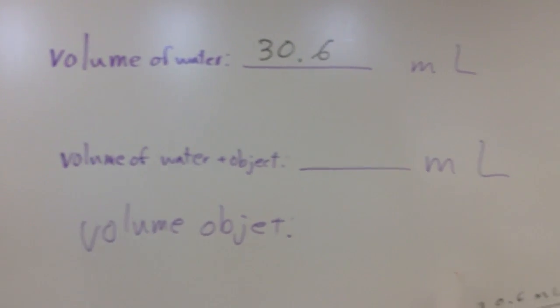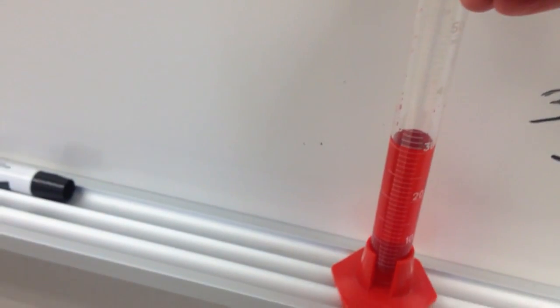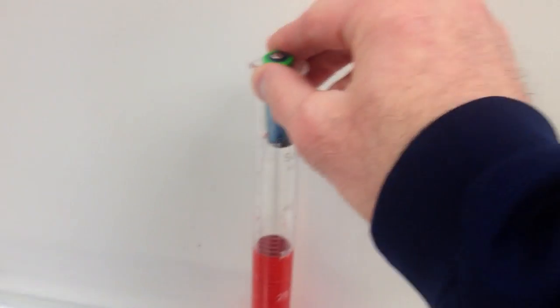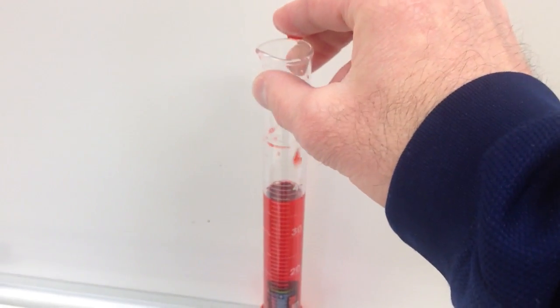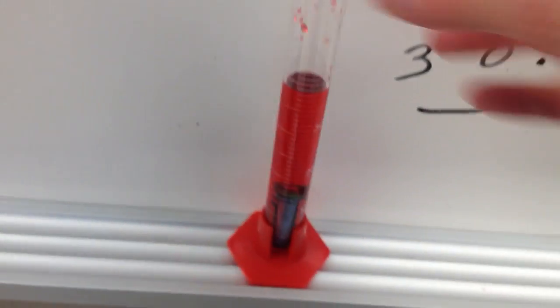Now I've got the volume of my water plus object is what I want to measure next. So I'm going to take my battery, which I left on my balance, which is just rude because that means other people can't be using it. I'm going to take my battery and I'm going to place it gently and carefully so not to splash everything into my graduated cylinder. That was way too much splashing. I should probably start over again because I probably lost some of my water.